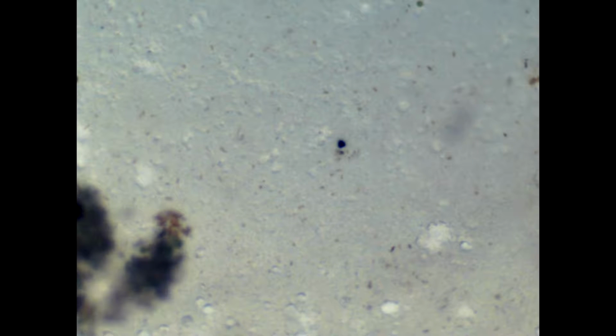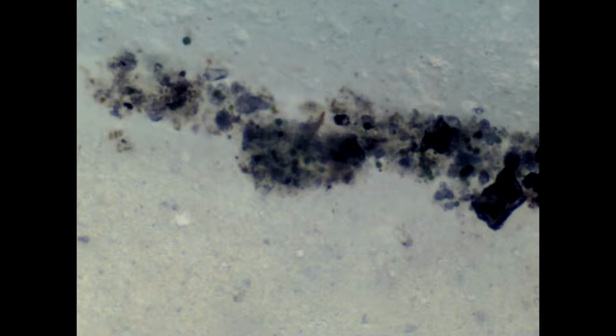Alright, so this is a microscope, and as you can see, we are looking at the plastic. It looks really clear, and that is because the pigment is being eaten away. And these colonies right here, if you'll notice, there are some little specks swimming around there. These are colonies of detritus and bacteria. So there are definitely microbes eating away at this piece of plastic. And that's not the only colony. There are many others, and that orangish, yellowish collection of dots there in the center, those are bacteria and bacterial colonies.